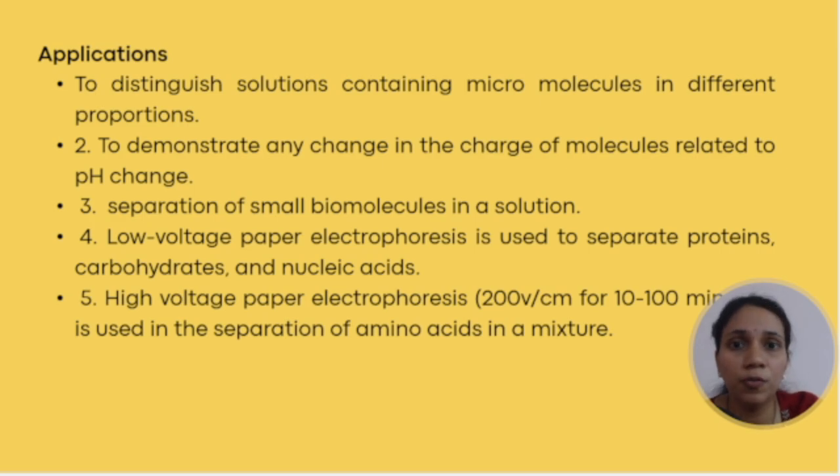Or if you are working on the development of some product, you need to be very sure of whatever you have separated. So such a thing becomes a problem because of the low resolution produced. Secondly, it becomes a little laborious, that it is comparatively slower as compared to the gel electrophoresis process. Alright. So with this, let us move on to the main content, that is the gel electrophoresis.